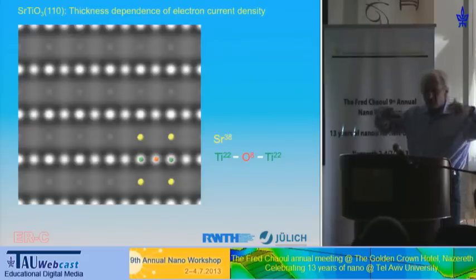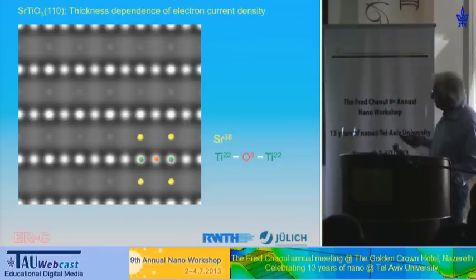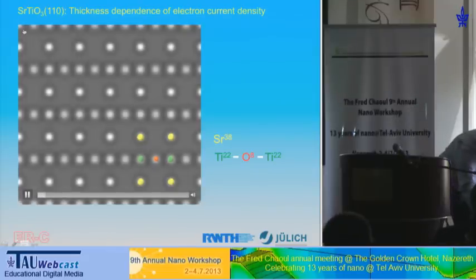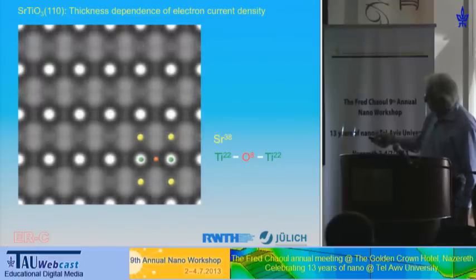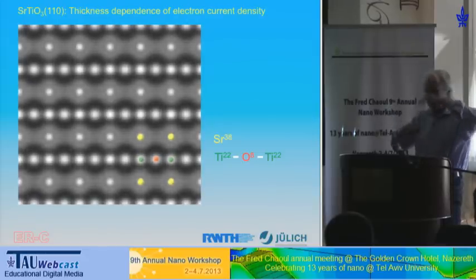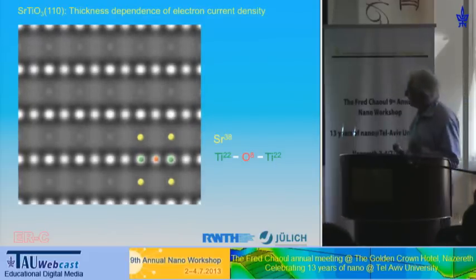So this is not that we are unable to do proper microscopy or so. That's the physics. There are certain depth values where strontium cannot be seen. Okay, but this, as you will see, is not an obstacle. But I just do this again, and you see also how slowly the oxygen develops here. This is the oxygen, very slow behavior. You see, while the strontium just oscillates quickly with increasing depths of your specimen. So that's the behavior of a specimen in quantum mechanical dimensions.